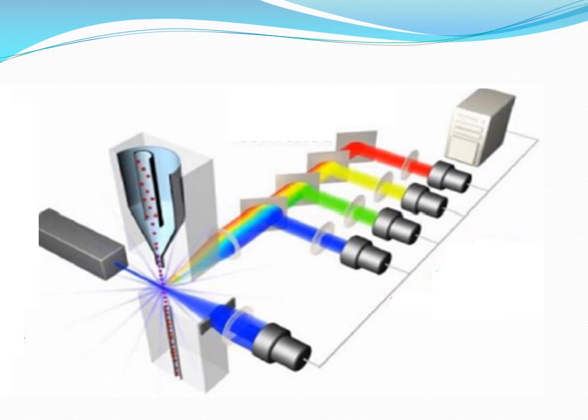So a common way of studying more of the parameters or cell characteristics is using fluorophores in flow cytometry. It involves using different types of fluorescent molecules which are compatible, having different peaks. They are used to label, say, antibodies, and these antibodies then attach themselves to the cell surface or a particular part within the cell, to certain cell organelles or anything, and then they flow down in the sample.